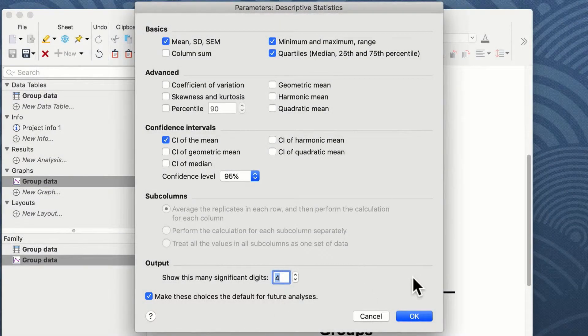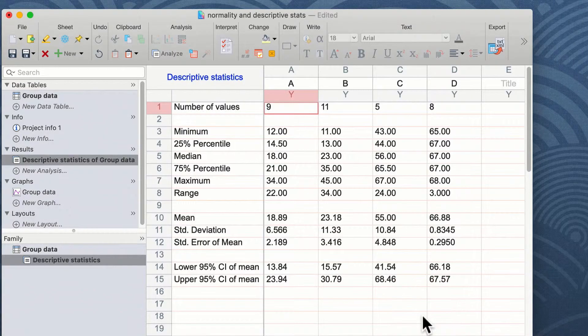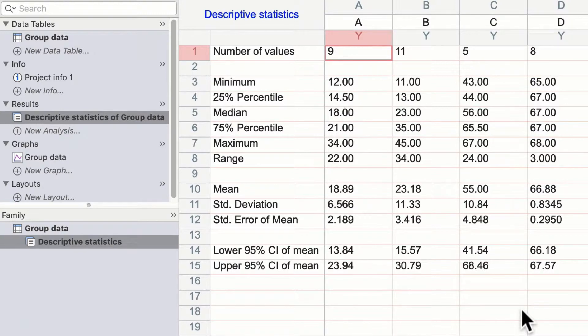Once you've selected the statistics you wish to view, you can click on the OK button, and when you do this, the descriptive statistics results window appears on the screen.